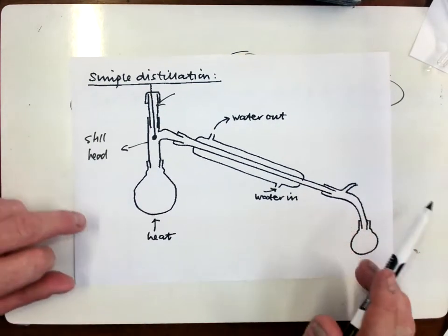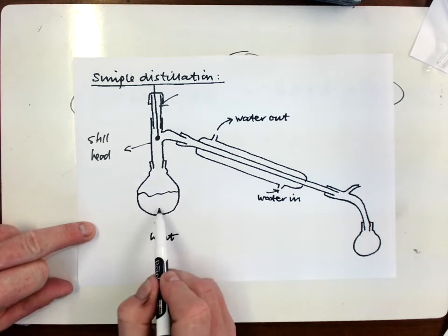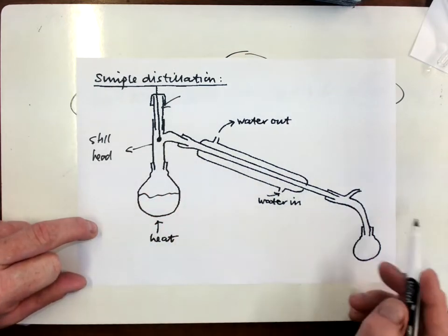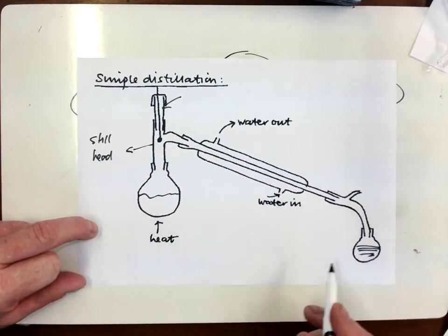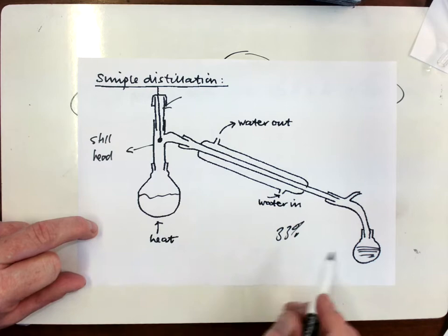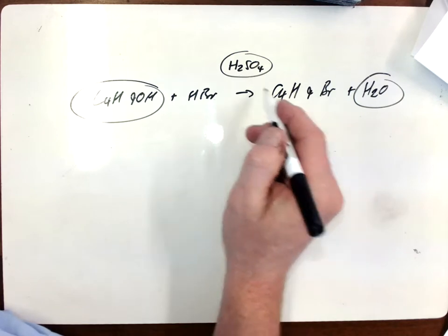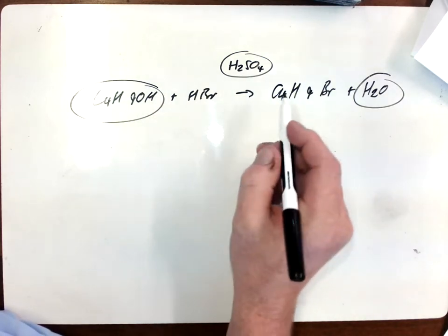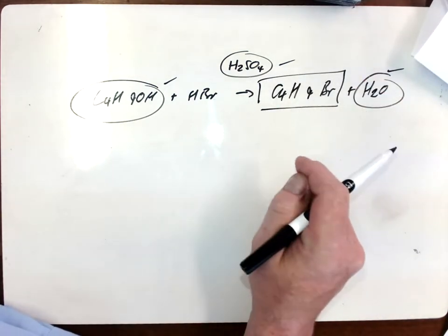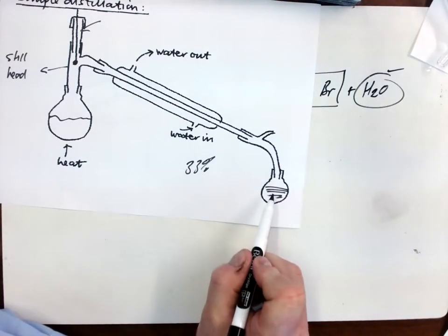And we're now into distillation, and our product, and some other things as well, will rise up, go across, and we can collect them over here. We usually collect about a third roughly of what was in here. Now that will still have some of these in them, but to a much lower extent. So we've still got a bit of that, a bit of that, a bit of that, but we have increased the concentration, as distillation does, of our desired product. And that will be in this flask here.